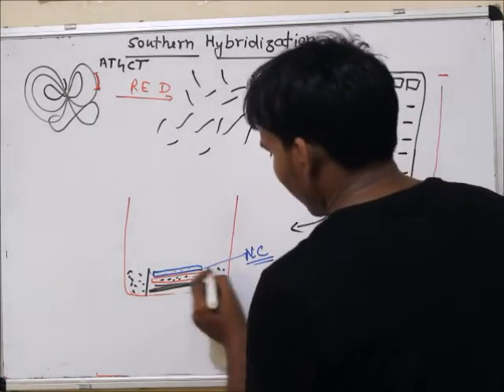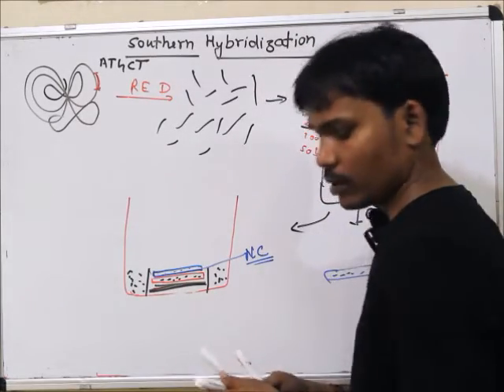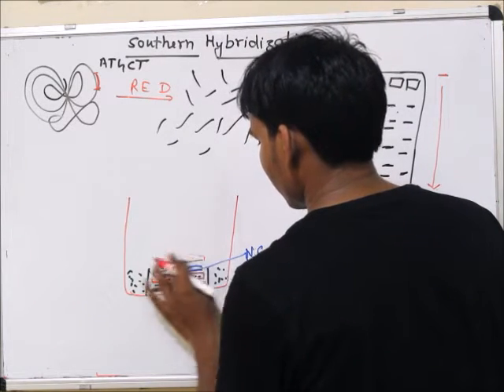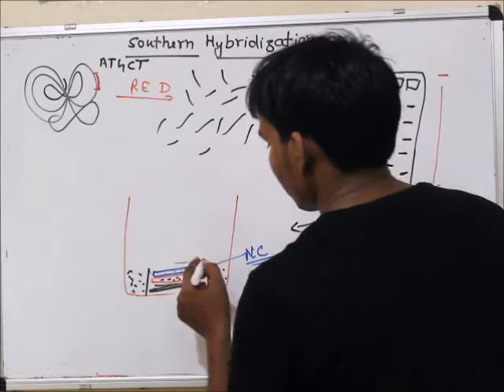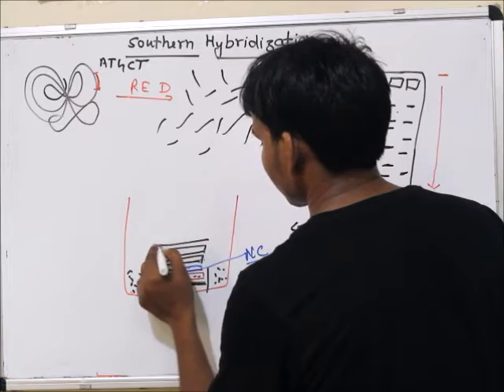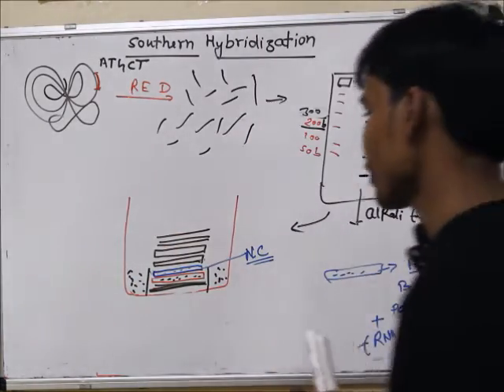Above the nitrocellulose paper, I place a number of paper towels to absorb the buffer.